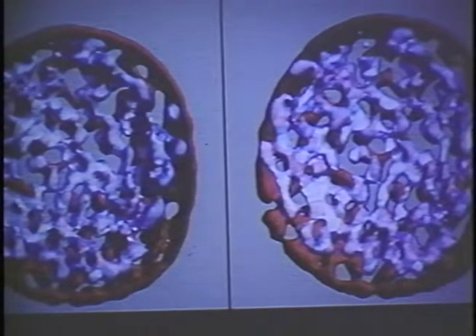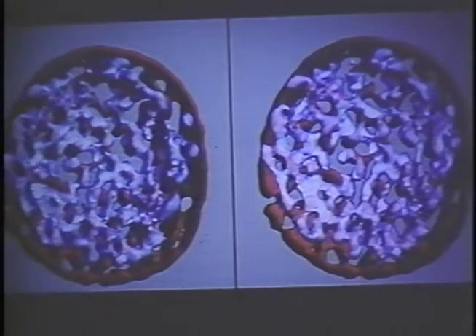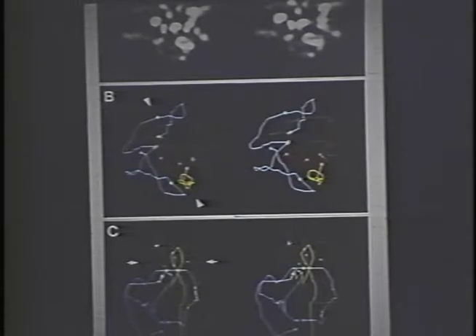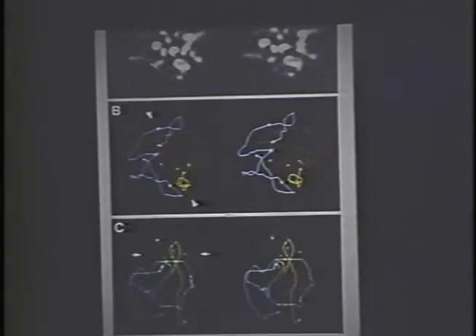Another way of representing the data, which we've seen before, is these solid surface images. And shown here, again, is looking at 2 aspects of the specimen simultaneously, again, by using different colors and, in this case, transparent surfaces. Now, as I said, the key thing for us is the ability to do this 3-dimensional model building, and I just show here, this actually comes from 3-dimensional light microscopy.